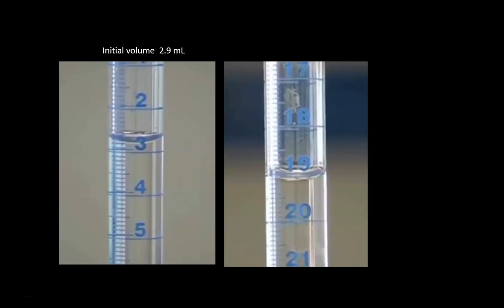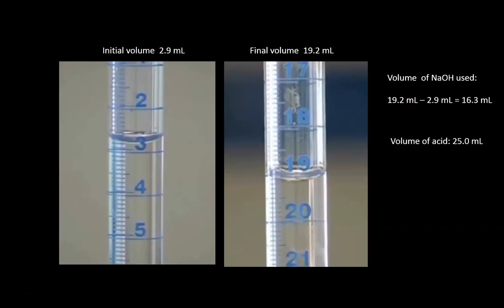At the end of the titration, you can see it's just below 19 milliliters. Although it's not clear here, let's estimate the level to be 19.2 milliliters. The volume of sodium hydroxide delivered into the flask is simply the difference between these two, so you subtract them and we get 16.3 milliliters of sodium hydroxide. We also have 25 milliliters of acid that was titrated to the end point.